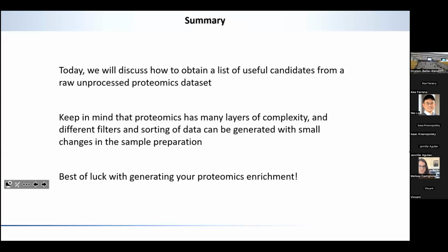That value corresponds to what we estimate to be the peptide abundance that then is converted into protein abundance. But because those chromatographic profiles are supposed to have a Gaussian distribution, you need to be able to tell where that signal begins and ends to tell, okay, this is the intensity of my peptide.